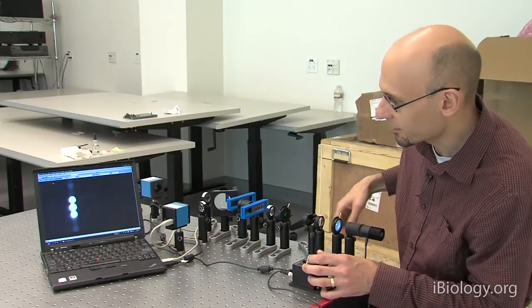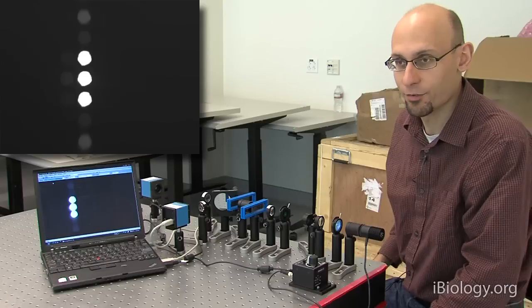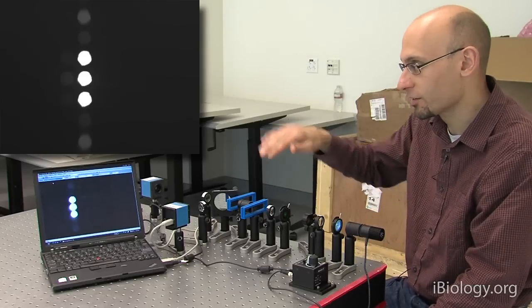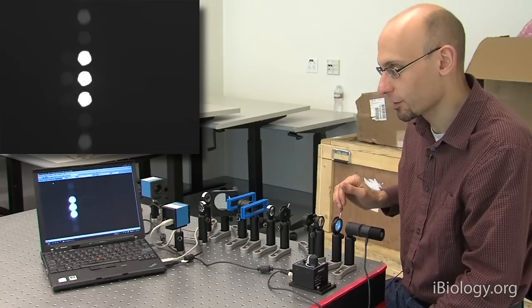And yes, exactly as we expect, we now see a set of spots located in the vertical direction. So we're getting information about these lines that are in the horizontal direction showing up in the vertical diffraction pattern in the back focal plane of the microscope.